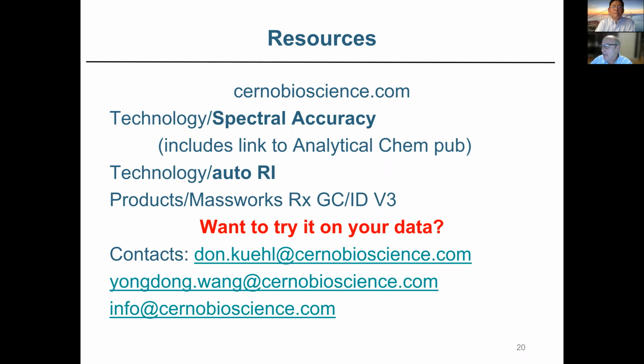If it's not in the library and it's still an unknown, I call it an unknown because you don't even have it in the library. The only thing you can really do is use the formula identification to try to tease out the structure. If you think about MSMS, you're doing fragmentation experiments to try to back out the structure. If you think about EI, all the fragmentation happens at once. It's highly energetic, but you do get fragments and they do give you clues to the structure, but you do have to work your way back and they're not easy problems.